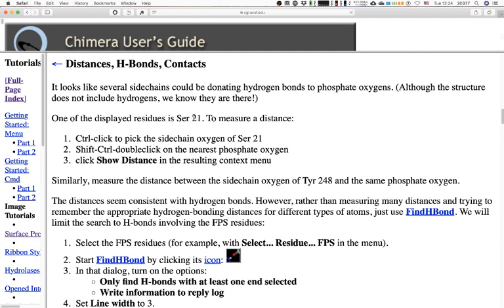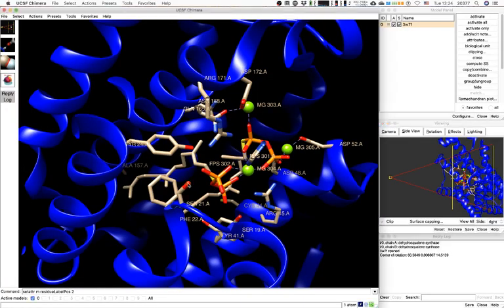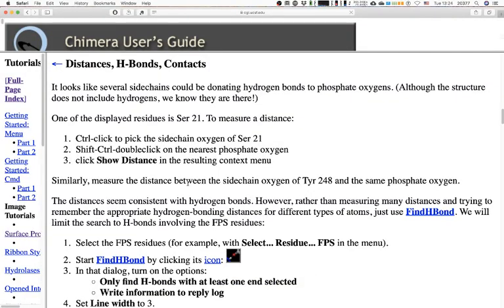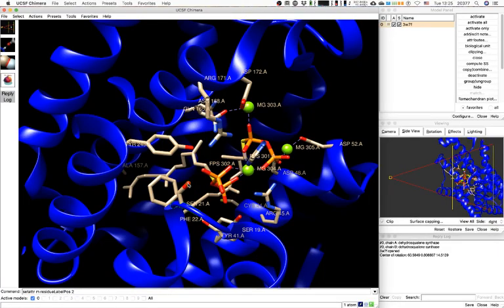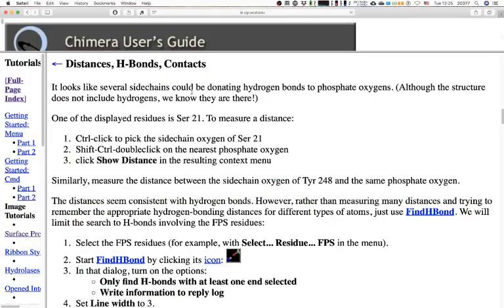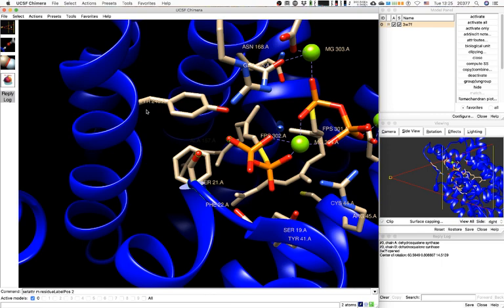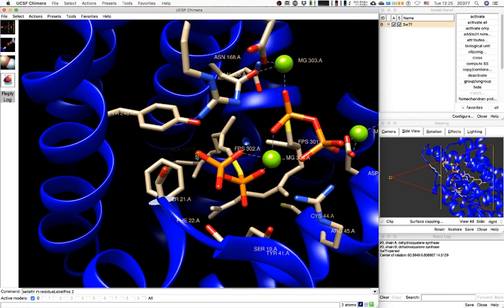One of the displayed residues is serine 21. To measure a distance, control-click to pick the side chain oxygen of serine 21, then shift-control-double-click on the nearest phosphate oxygen. Then click 'Show Distance' in the resulting context menu. The trick is the double-click. I haven't used this tool before — it's a new discovery for me.